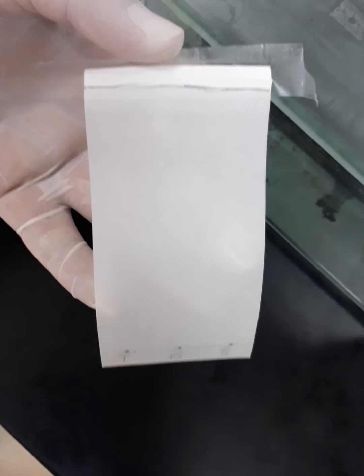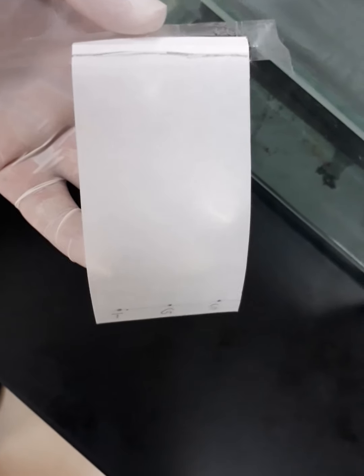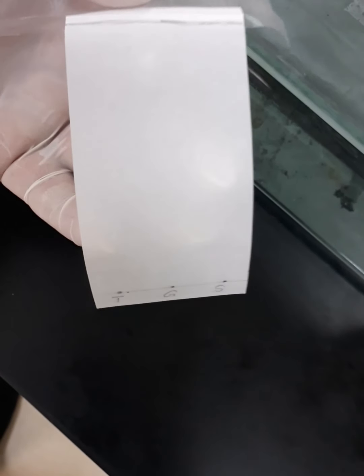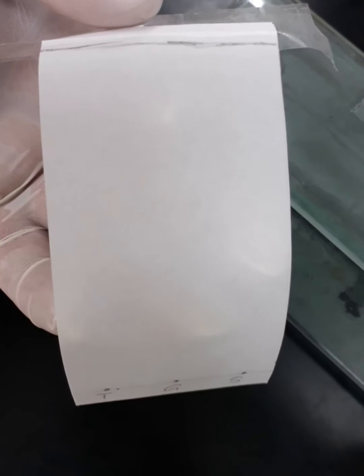Now we marked the solvent front, or the front line, and now we are going to dry that paper. Notice that there are no visible spots on it. Okay, now we are going to dry the chromatogram. Notice here this is the pencil line, which represents the solvent front, the line between the dry and wet area. And now we are going to dry this chromatogram.